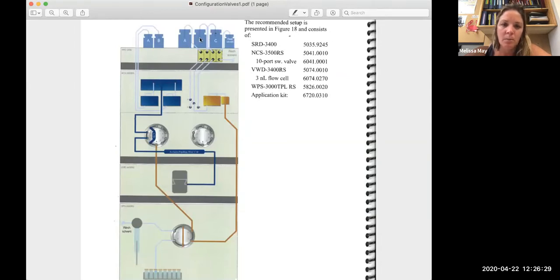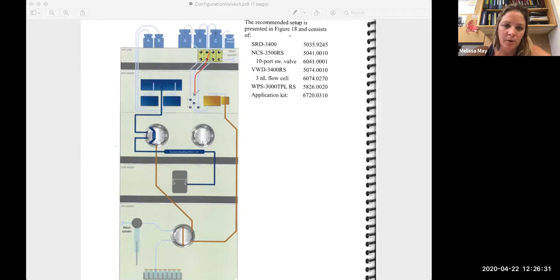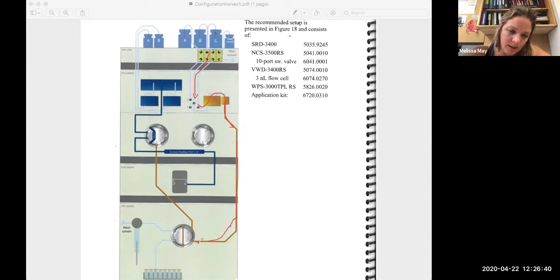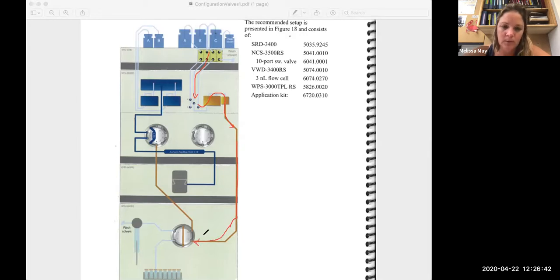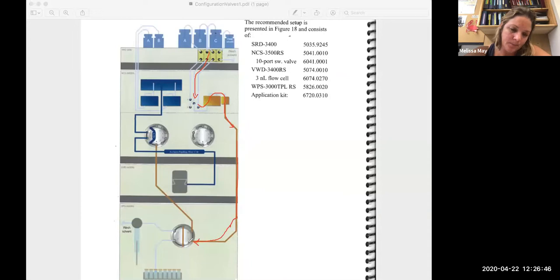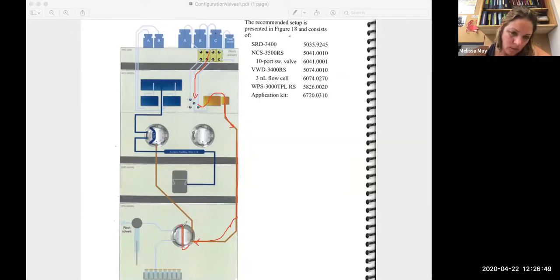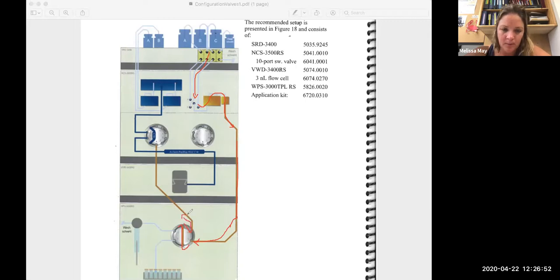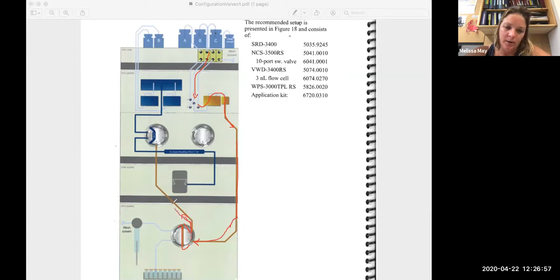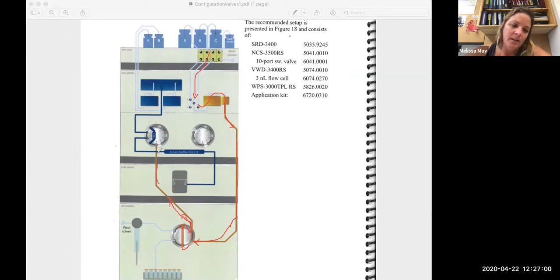Down one of our capillary tubes and into this port. It can pick up sample depending on which position you have this port in, or it could just go directly to this line and kind of bypass that. But basically, so that would be the difference between the injector load position on the autosampler.